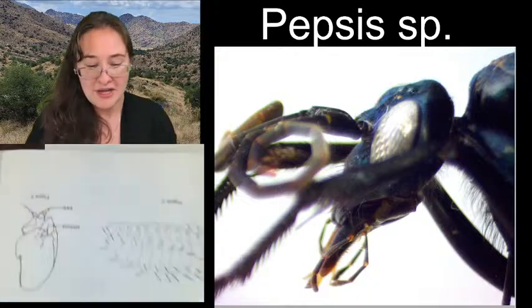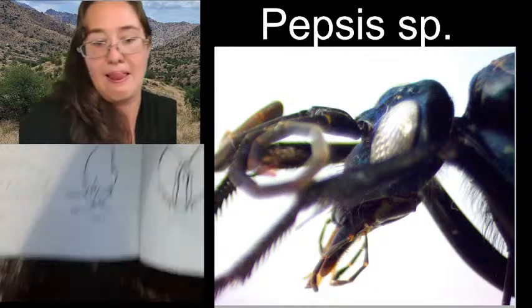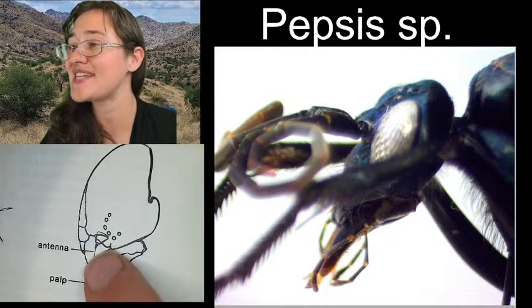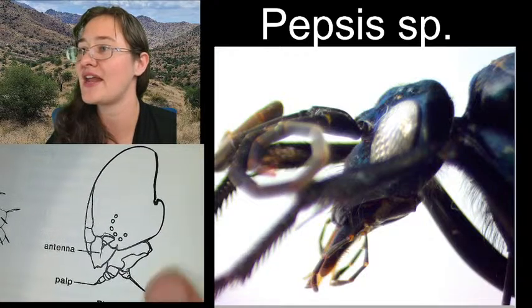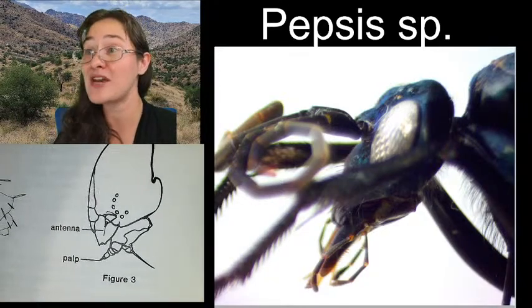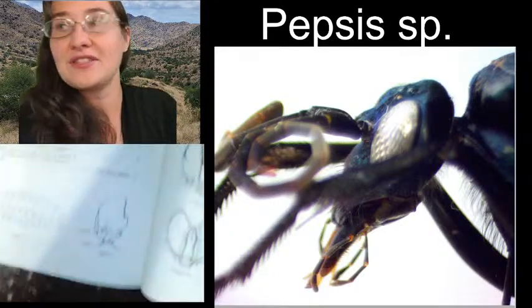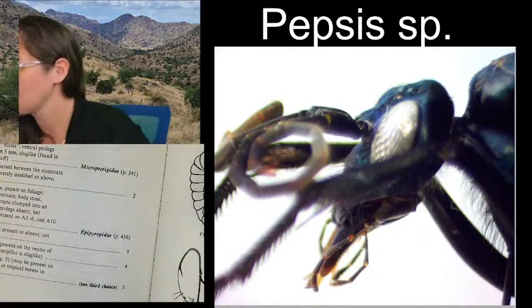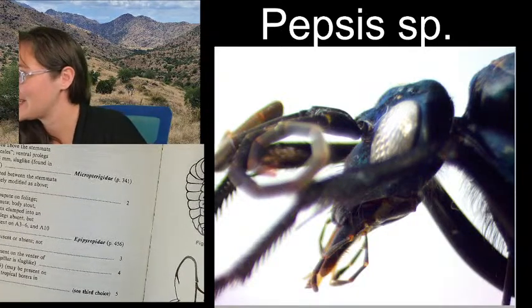But, okay, so this will work. This is an image of the whole caterpillar's head. And so that's what I wanted to show you. Let's see if I can get it right. This is a caterpillar head. Right here, that's the antenna. It's just like this little peg, and it has this little itty-bitty hair coming off of it. And that's the antenna. And then that little half circle of dots, those are the eye spots. And no, caterpillars do not have compound eyes. I don't know how well they see. I wouldn't think that they see great with those little itty-bitty eyes. But where are those eye spots? Yes. Let's see.